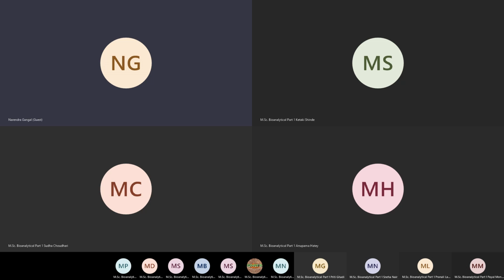That negative ion is again formed by a chemical ionization process. That is a very sensitive mode, because we discussed something called S by N ratio. Everybody must be remembering that. So your signals may be low, but if the noise is further reduced, then you will have better sensitivity for the estimations. So that is what we saw.